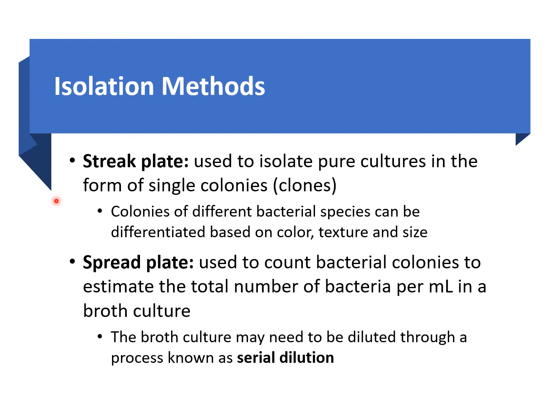And as I said, the streak plate method is going to help us isolate pure cultures of bacteria. Now there's another plate that we're going to discuss more later on called the spread plate. The spread plate is mostly used to count the bacteria colonies. So if we want to count how many colonies I have, I do a spread plate.